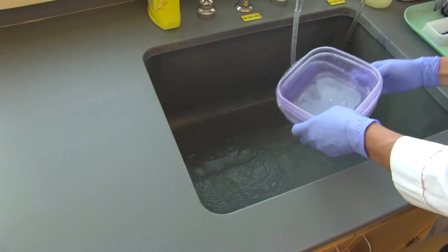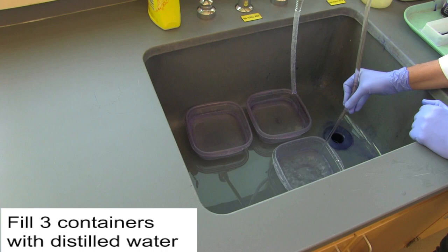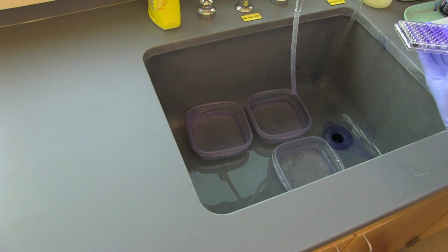After the last wells have been filled with crystal violet, let the plate rest for at least one minute. While the cells are staining, fill three containers with distilled water. This will be used to wash out the excess crystal violet.